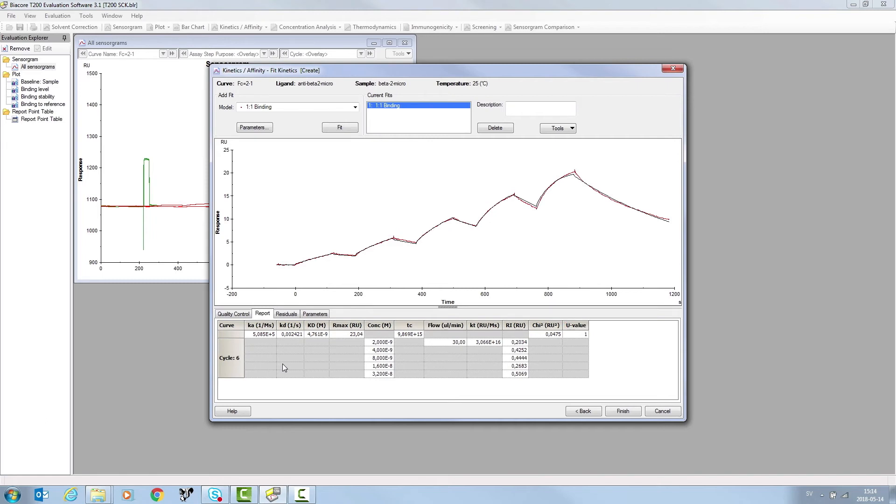Visually, the fit looks good between the model and the experimental data, and we report a chi-squared of around 2% of the reported rmax.